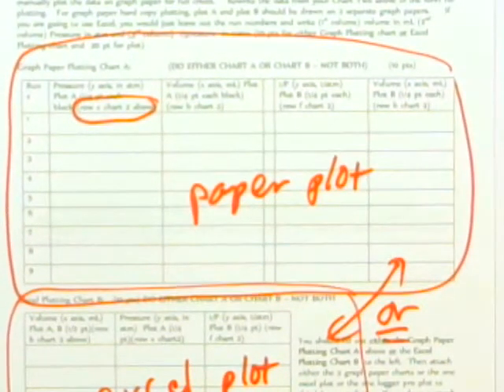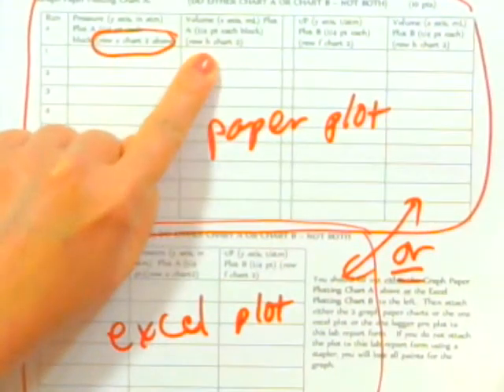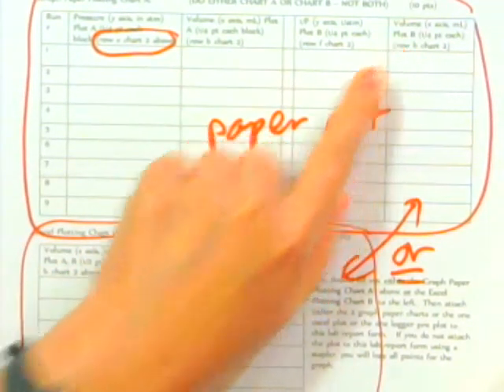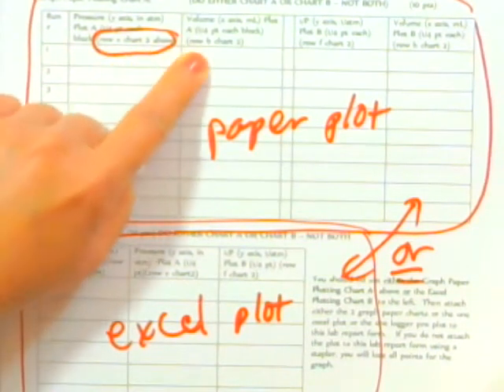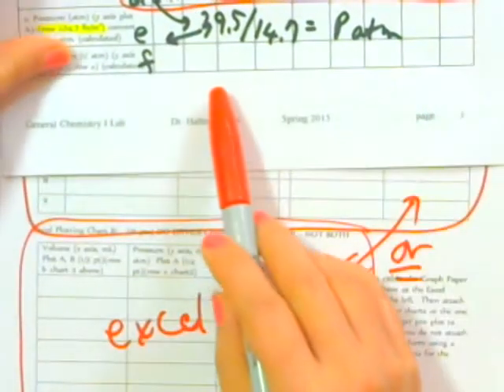And what I want here is, this is going to be the pressure in atmospheres. This is the volume in milliliters. This is 1 over pressure, and this is volume. That's what it says if you read the LabPart form. And this is row E of chart 2 above. This is row B of chart 2 above. So you're just going to use that last row of your LabPart form, this part of your LabPart form.